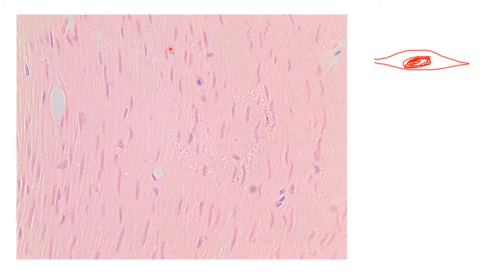When you look at dense, regular connective tissue, the cells are squeezed completely flat. So it's just going to be a dark line as opposed to the fat nucleus. So make sure you're making the comparisons. I'll type it here in the chat. We need to compare this to dense, regular connective tissue. And again, that guided lesson puts some pictures side by side for you to make sure you're making those comparisons.